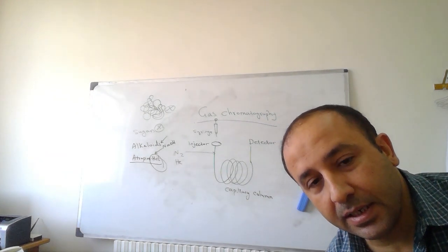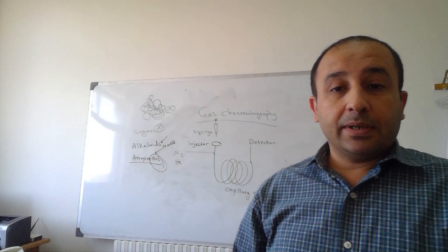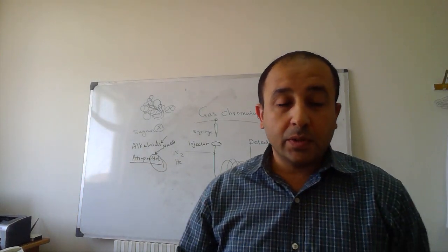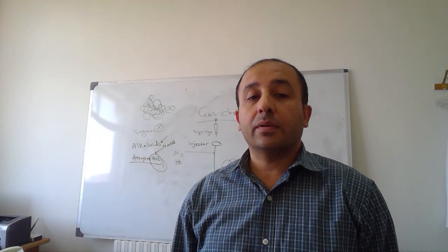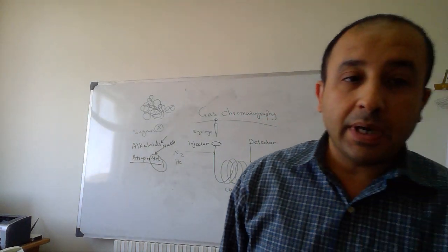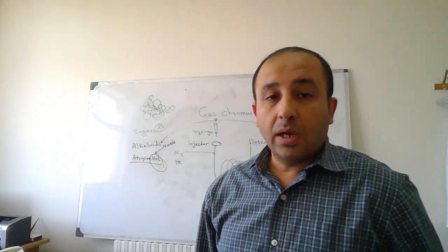And in this case, after treating atropine with a basic compound, you can get it lipophilic, and consequently we can analyze atropine by GC, particularly when we have mixtures of alkaloids.